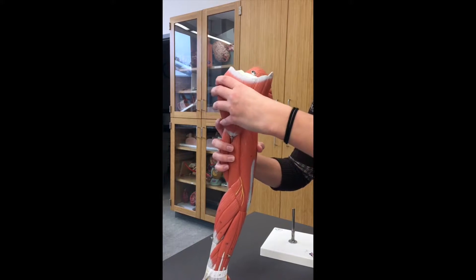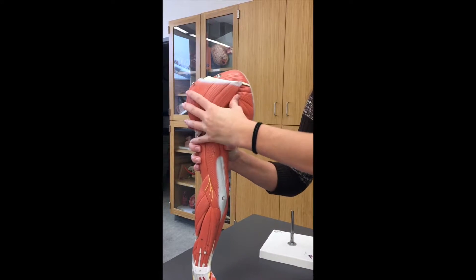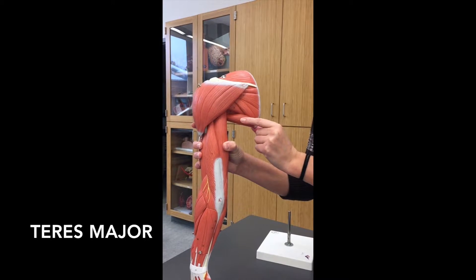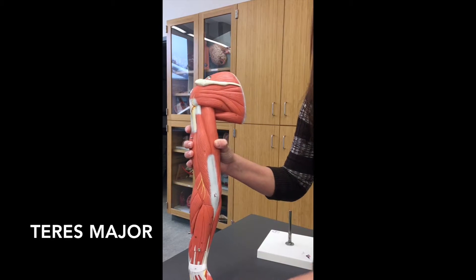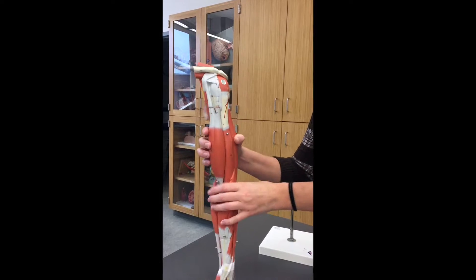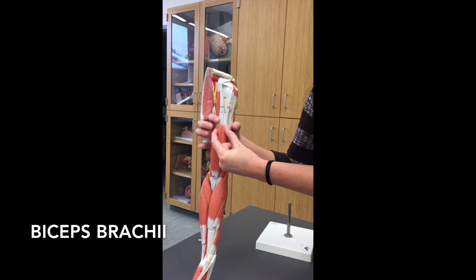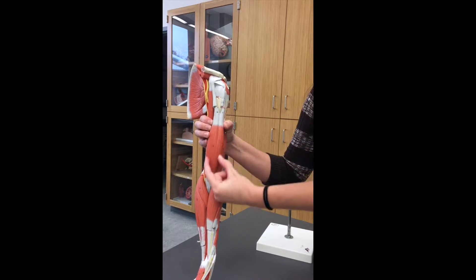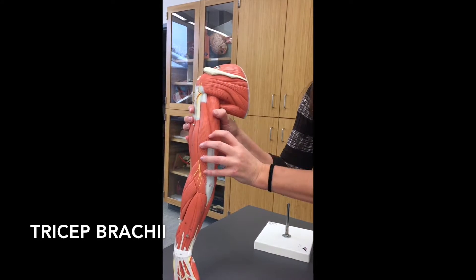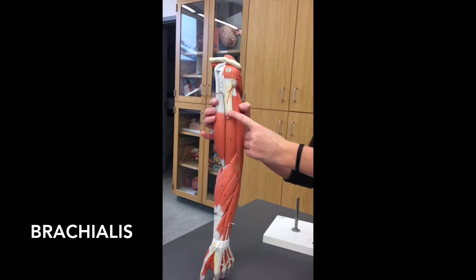If you put the deltoid back on, it makes sense why they're named the way they are. The smaller one is going to be your teres minor, whereas the larger one will be teres major. With the deltoid off, remember that the teres major is lower and the teres minor is a little bit higher. Moving down the arm, on the front when you flex your arm, this is going to be your biceps brachii — it has two branches, so it's called a bicep. Whereas on the back, you have three muscles forming the triceps brachii. The guy hiding in the middle is going to be your brachialis muscle.